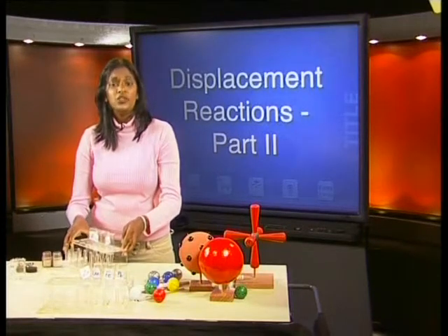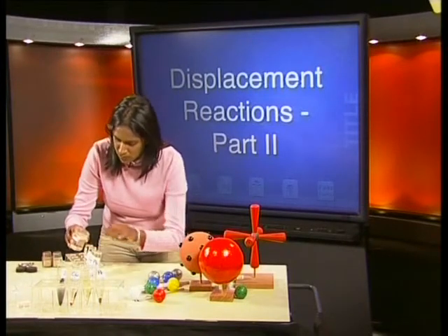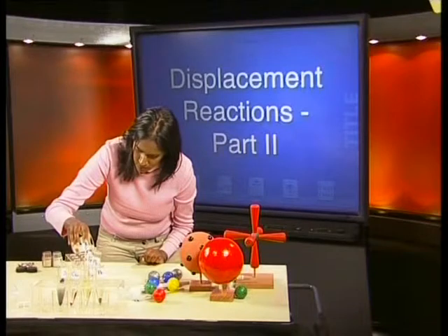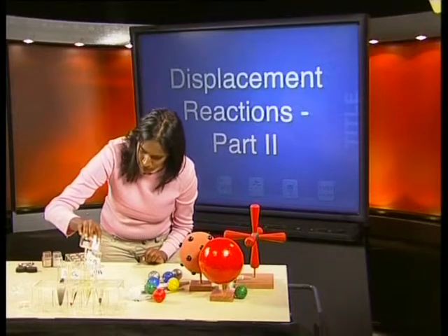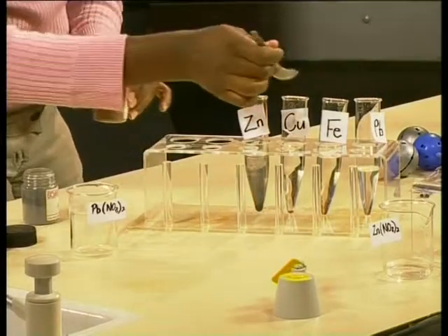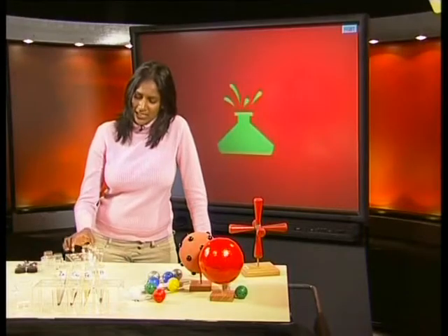I'm going to just set these aside and do exactly the same for the lead 2 nitrate solution. Looks like it's probably going to take a couple of minutes before we see any worthwhile results.